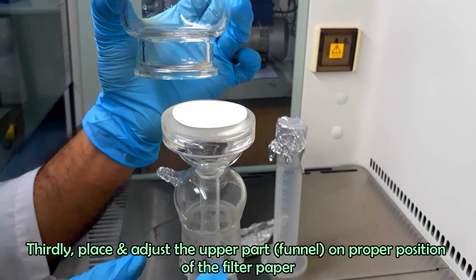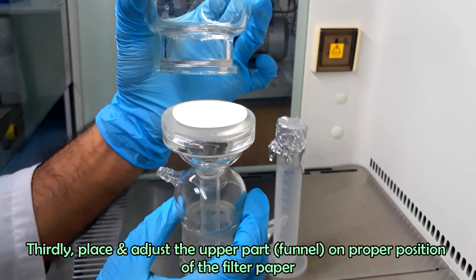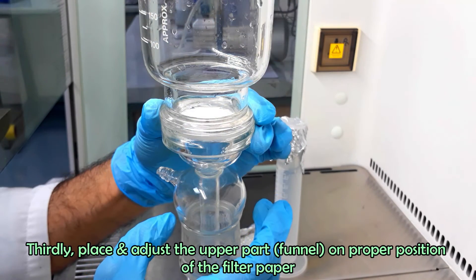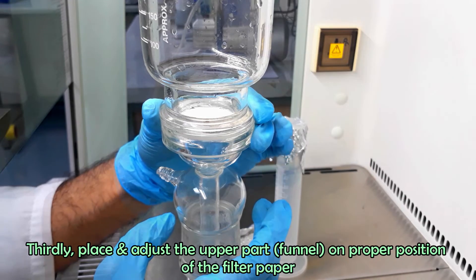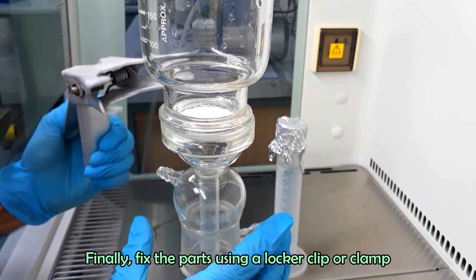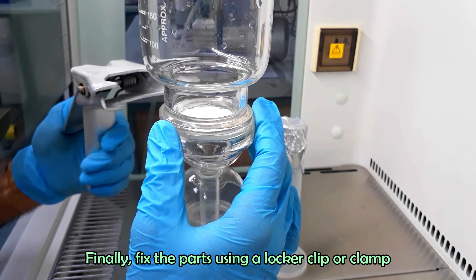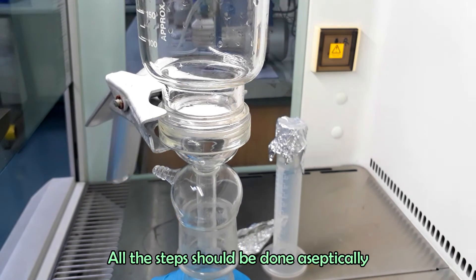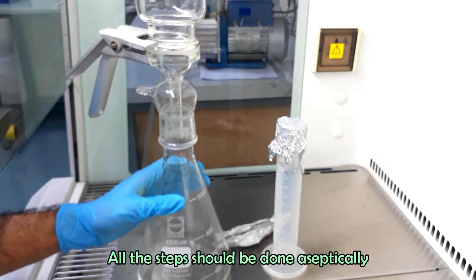Thirdly, place and adjust the upper part in the proper position on the filter paper. Finally, fix the parts using a locker clip or clamp. All steps should be done aseptically.